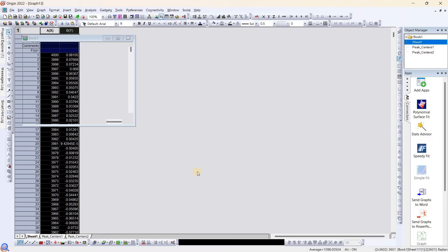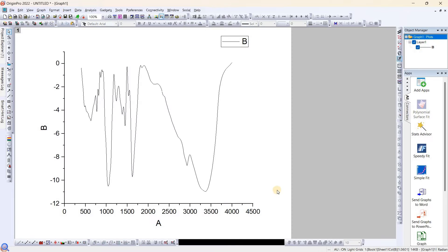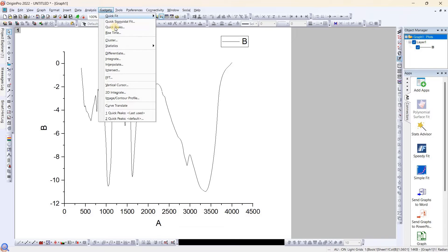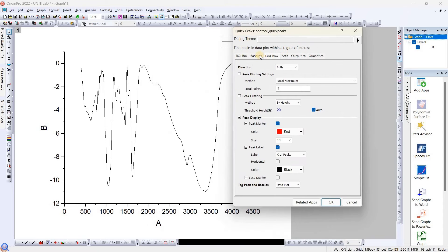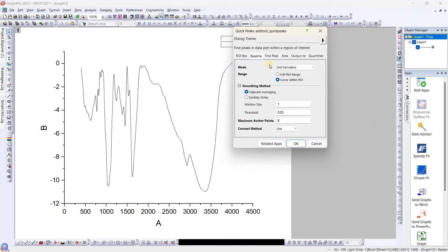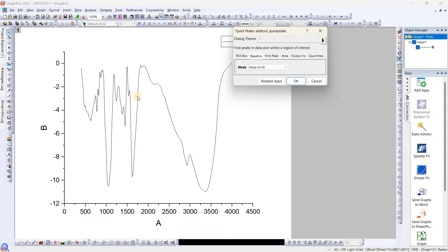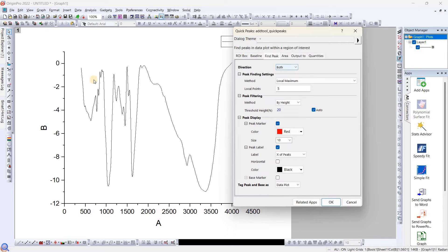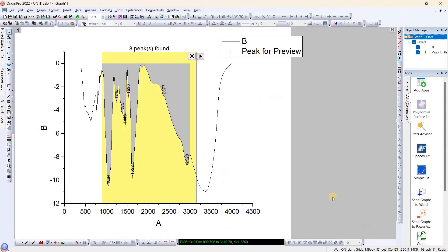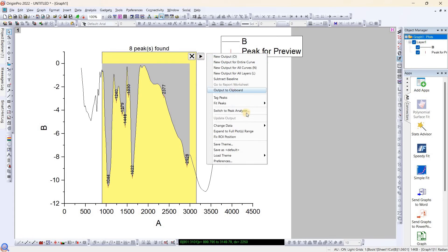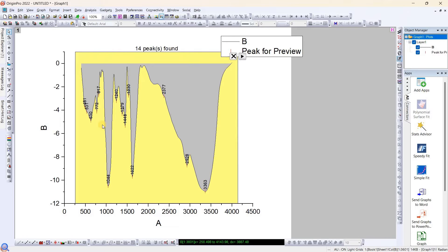The next method, which I prefer for peak finding and labeling, is go to Gadget and select Quick Peaks. Here, first go to baseline and we will select again y equals zero. Go to Find Peak. We want to find the peak in the negative side, so we will prefer negative. Once we did this, we will click OK. Now they have found the particular area we want to find. We need to expand it to full plot, so we will click this one.